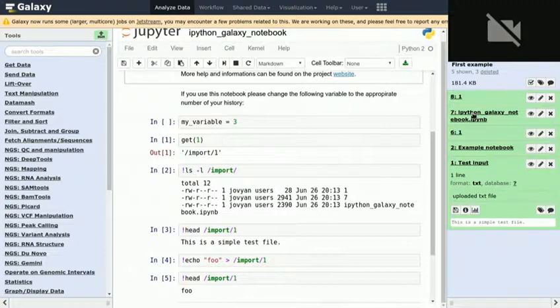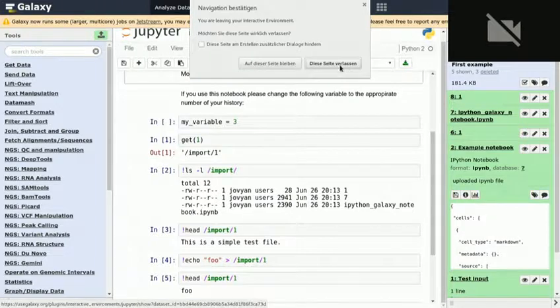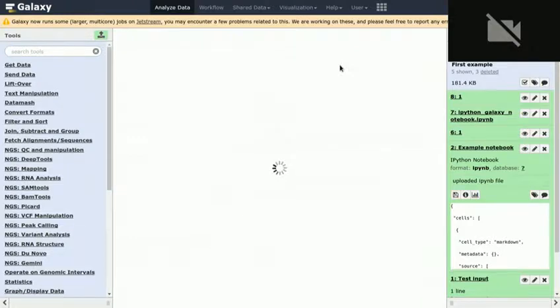Is this possible? Do you see this history? What I'm seeing? Do you want them to go to this URL?